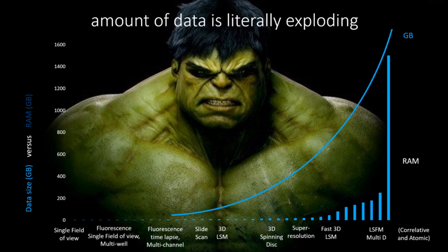I think nowadays we're working on workstations that have something like 500 gigabytes of RAM or 1 terabyte of RAM. But what do we see routinely? Images that are 10 terabytes and above. So these images are far bigger than the size of the computer. And what happens when you use your computer to hold all of your data? Your computer can become unstable.